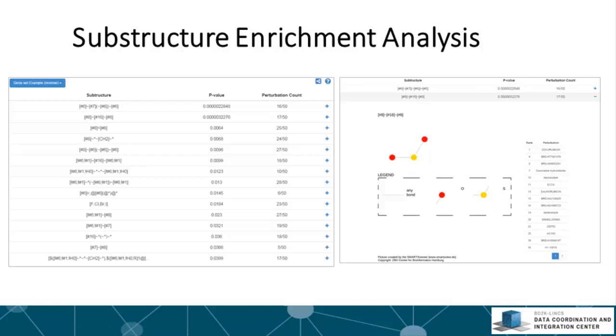The substructure is represented as a string in the SMARTS format. The p-value is computed using the Fisher exact test. The perturbation count shows the number of perturbations that have this substructure. Clicking the plus sign shows a visualization of the substructure and a table of the top perturbations that contain the substructure.